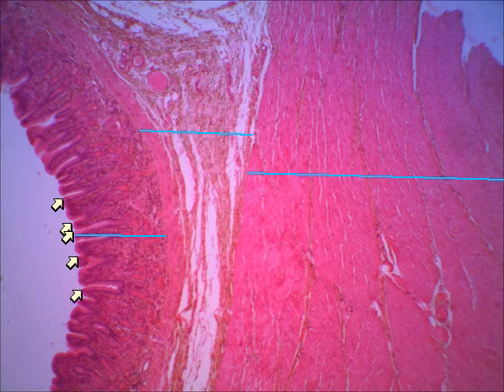Those openings that you're seeing there are the gastric pits. I want you to notice on this that the surface of the mucosa is somewhat uniform. We're going to see in the small intestine, it's not going to be nearly so uniform there. But make sure you can identify the little openings into the glands. Those are the gastric pits.